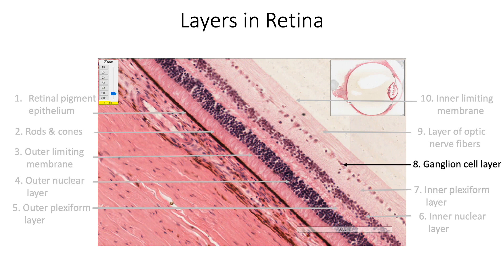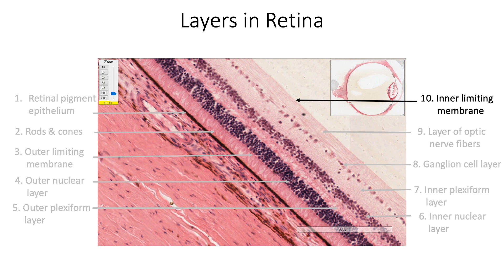In the ganglion cell layer, we see the cell bodies of ganglion cells — multipolar neurons arranged mostly as a single layer. The layer of optic nerve fibers contains axons of these ganglion cells, which run parallel to the retinal surface and converge towards the optic disc; branches of retinal vessels can also be seen in this layer. The innermost layer is the inner limiting membrane, formed by the foot plates of Müller cells, which separates the retina from the vitreous body.